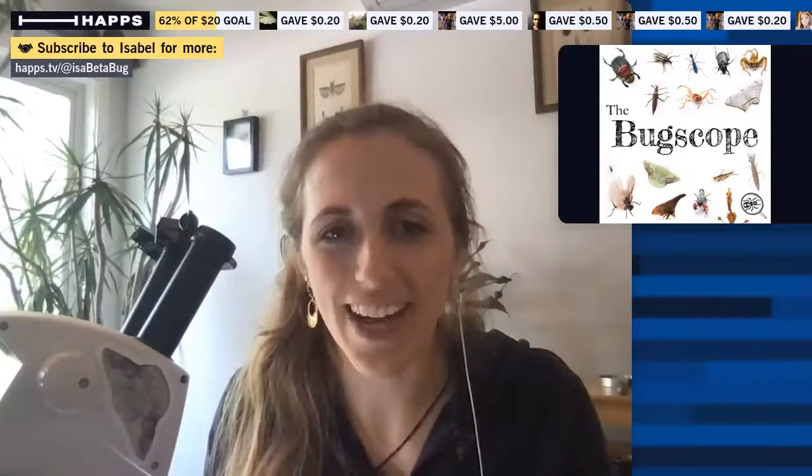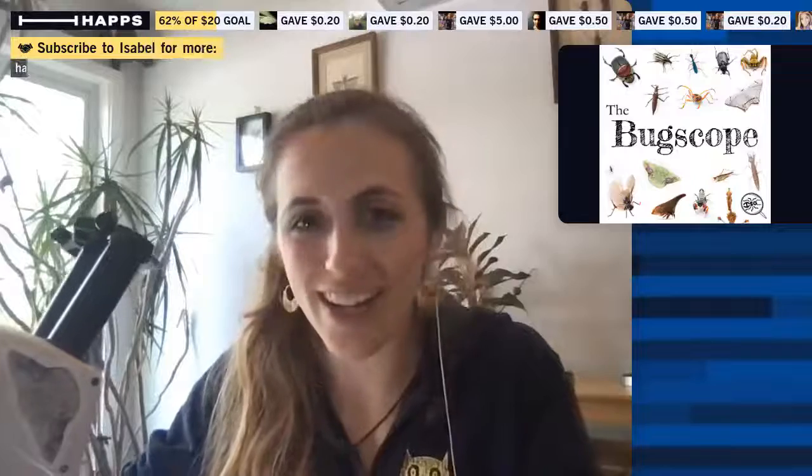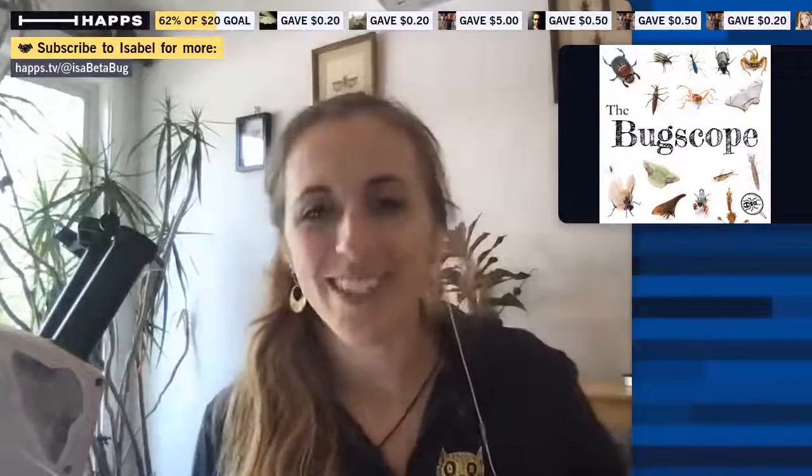One thing that's super cool about Haps is that I can use my iPhone as a second camera, so I do have that here. We're going to take a look at this bug I found in the backyard and I want you guys to guess what it is, so I'll bring it on screen now. Hi Pablo, how's it going? Hey Marion, good to see you.